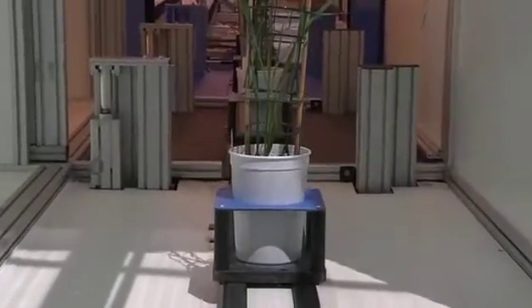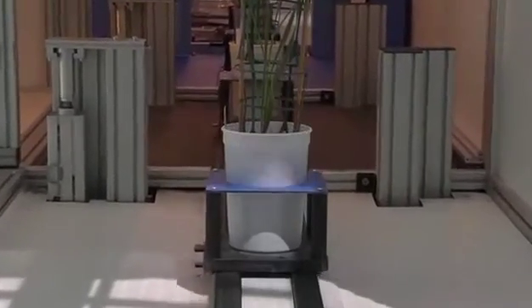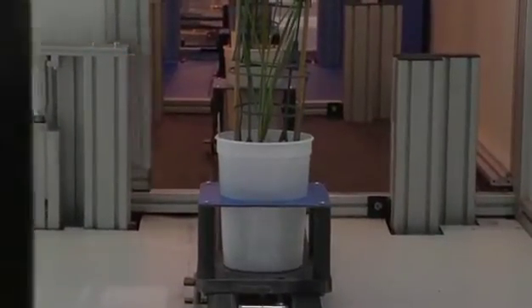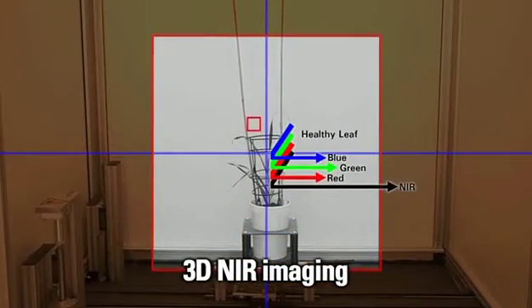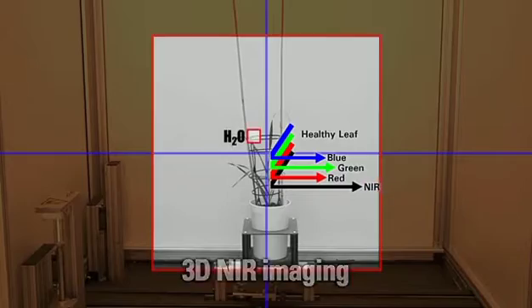Using a sequence of specialized chambers after color imaging in visible light, additional information can be extracted by employing near-infrared imaging, for example, to check the water status of leaves or root systems.